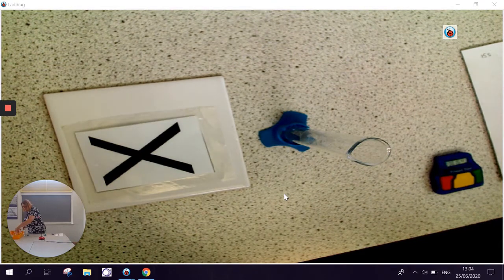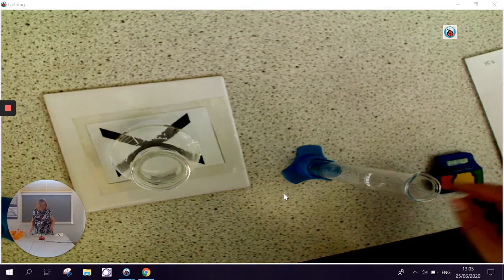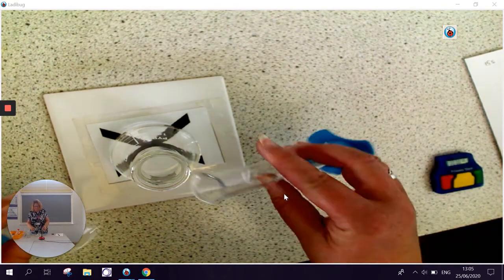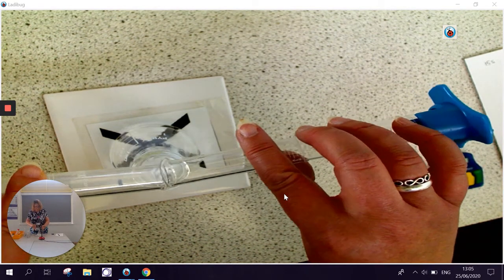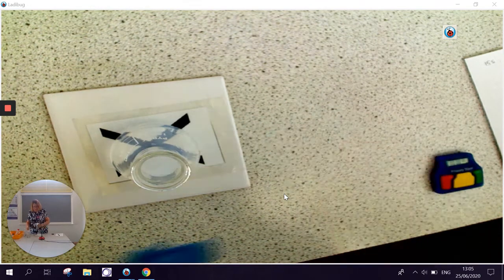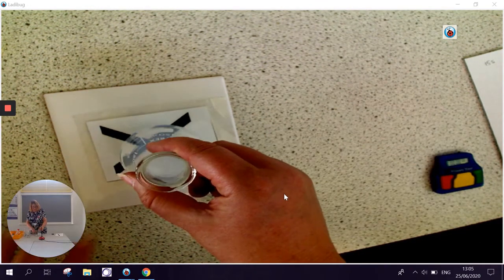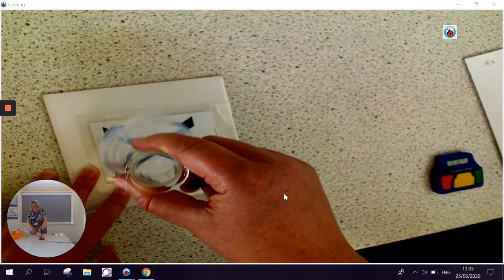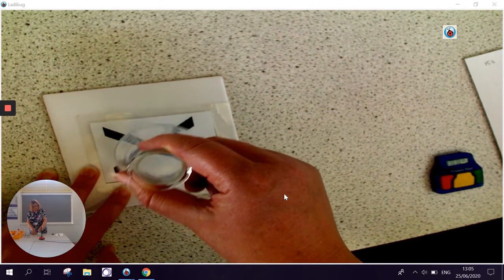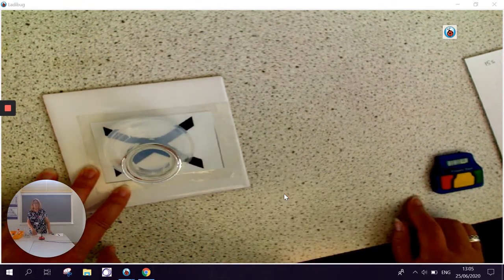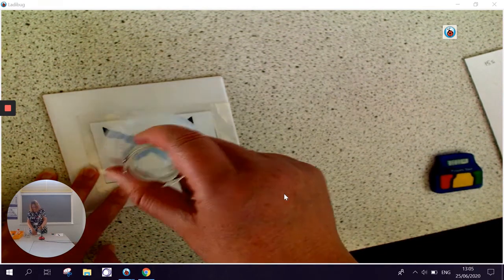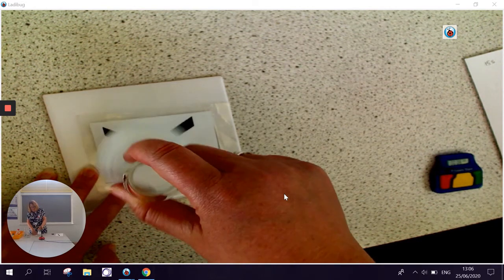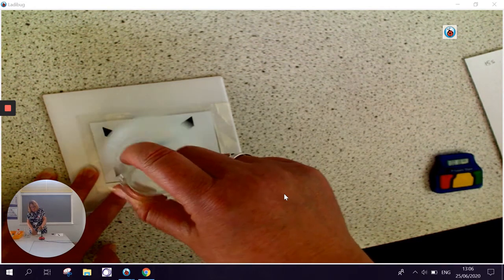I'm going to repeat the experiment again, now with a 0.25 molar solution, and we're going to see what happens. Because I swirled the first experiment, I'm going to need to do the same with the second experiment. It is clouding, and you can actually see it is taking longer for this one to go, but we're still actually getting a reaction happening.